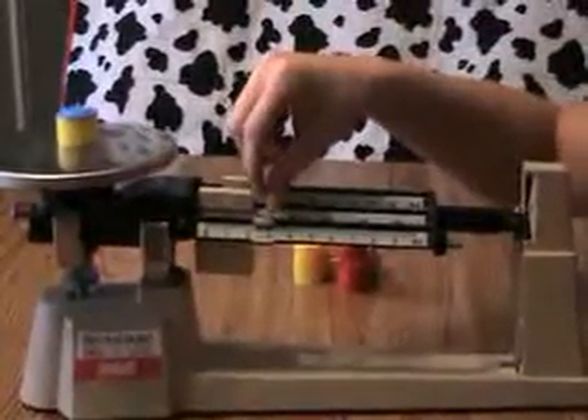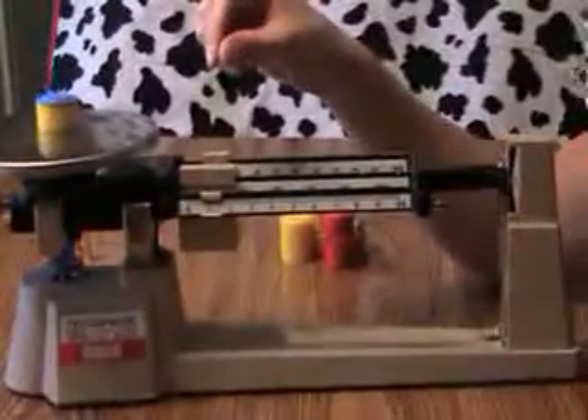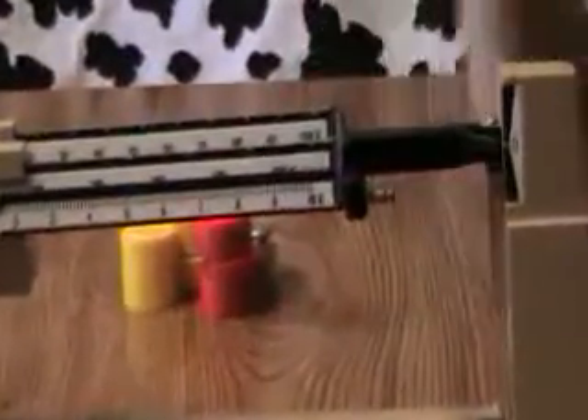Too heavy? Move it back a little. And perfect. So I have ten plus one, which gives me eleven grams.